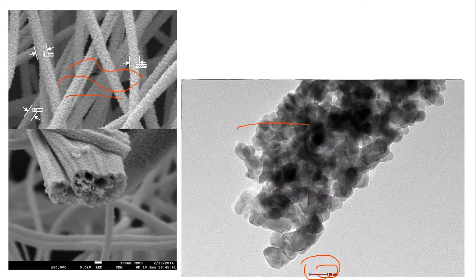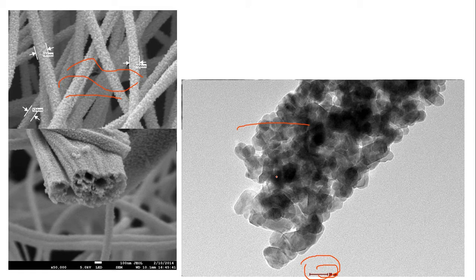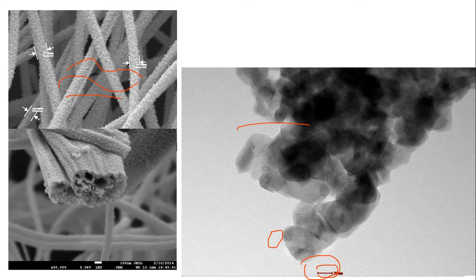And we further zoom here. You see here now the grains. Now we are recognizing the grain. You see these grains here. This is now one fiber. We are focusing now on one fiber. We further zoom here. So the grains are now clear.